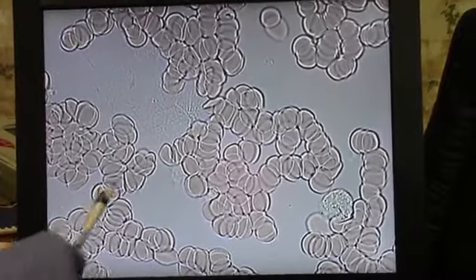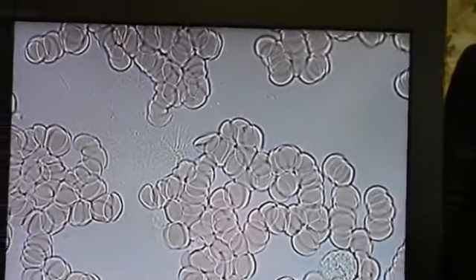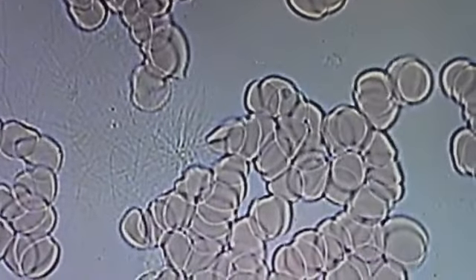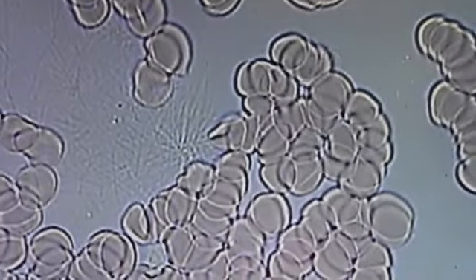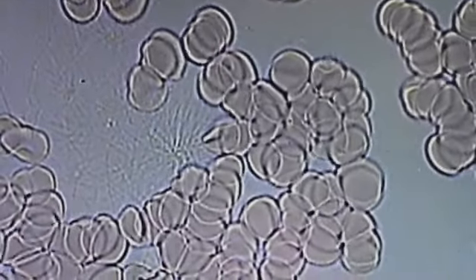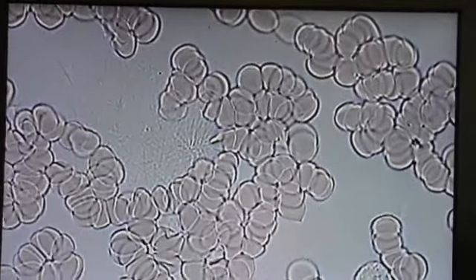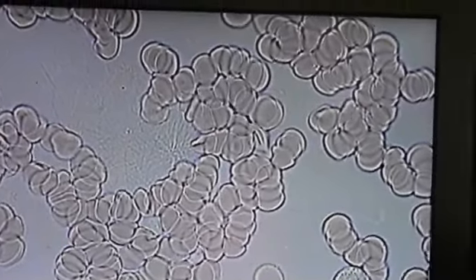Yeah, and you can see back here it looks like spider webbing everywhere. It's called fibrinogen. Fibrinogen is a protein that helps with blood clotting, and your liver is what regulates it. So whenever your liver is stressed or congested, we'll start to get excess fibrinogen built up in there. That's why they're sticking to it like that. Essentially that can end up creating high blood pressure. If you get too much of it, it can build up and create blood clots. So that's why we don't want that substance in there.